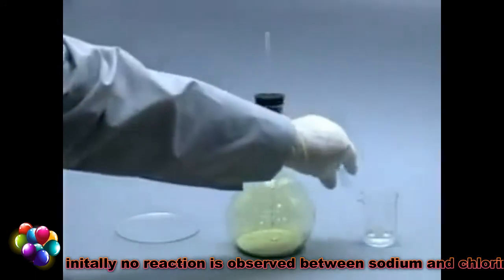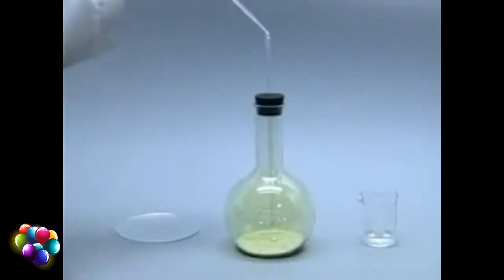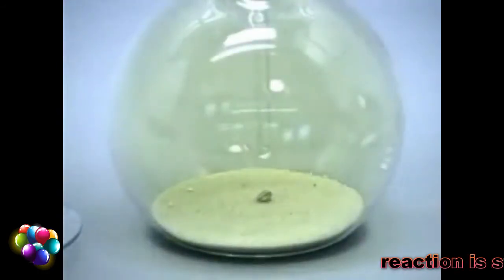Initially, no reaction is observed between the sodium and the chlorine. The reaction will be initiated by adding a drop of water to the sodium.